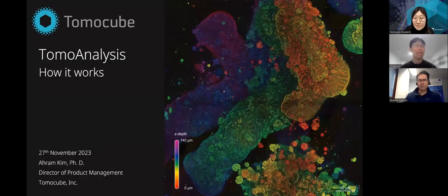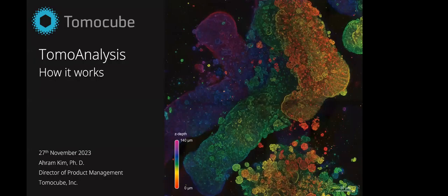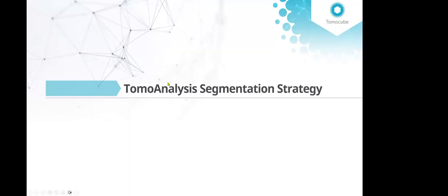So today I want to introduce TomoAnalysis, how it works, and what is the background or the running principles for the analysis. And then I'll briefly show how the workflow goes in TomoAnalysis. So let's see how TomoAnalysis makes the analysis.